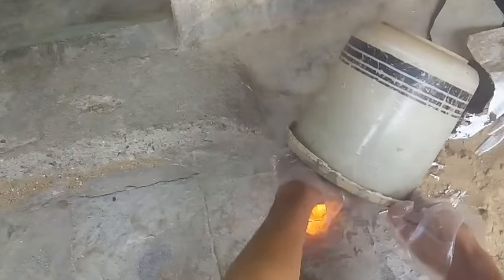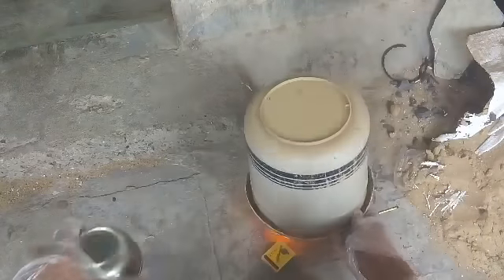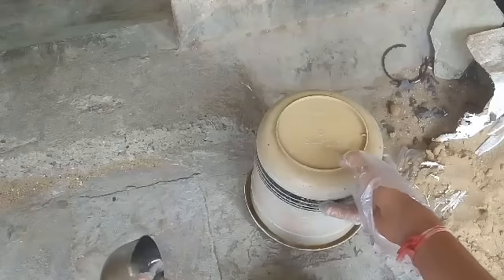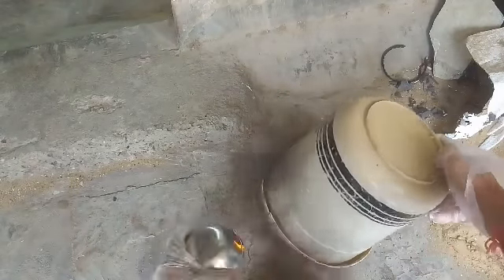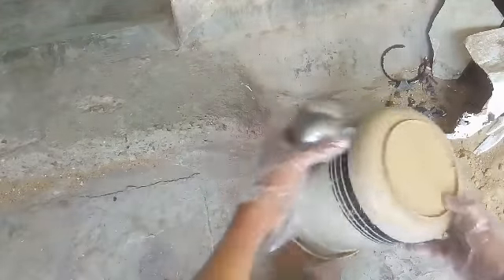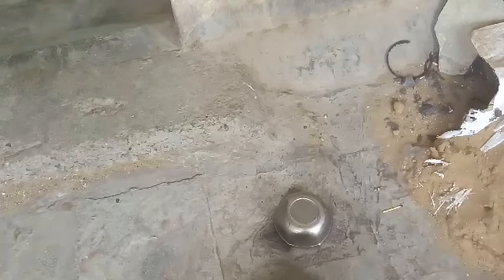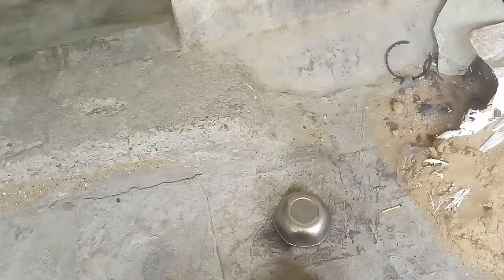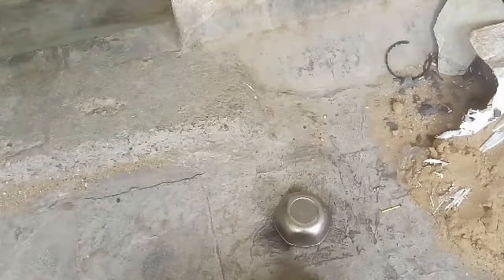So do this like it, and do not get this fumes on you, and if it goes out of control, then put the container on it. You can see as here it also works under the presence of carbon dioxide. I'm going to put it top on it. You can see it's very flammable reaction. You can see the container turned black because of the carbon, and this is the carbon which we want. So the reaction is going on very vigorously, and it gets very hot to touch.